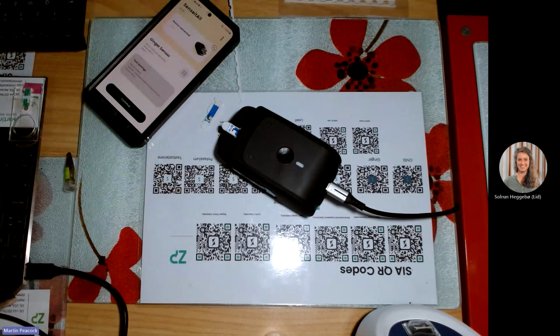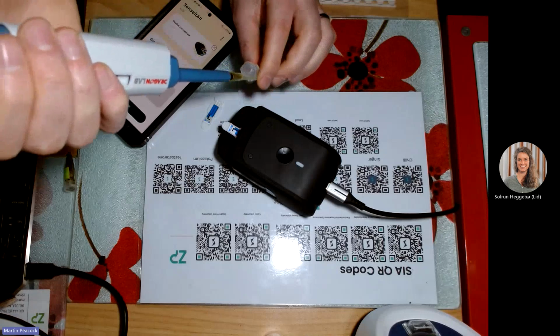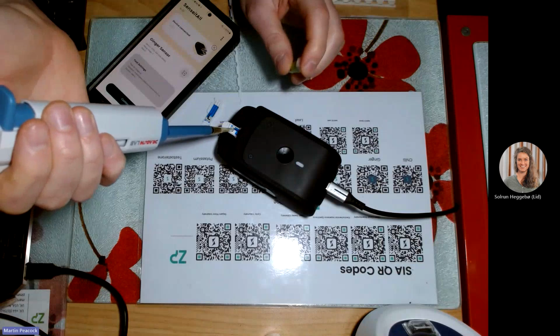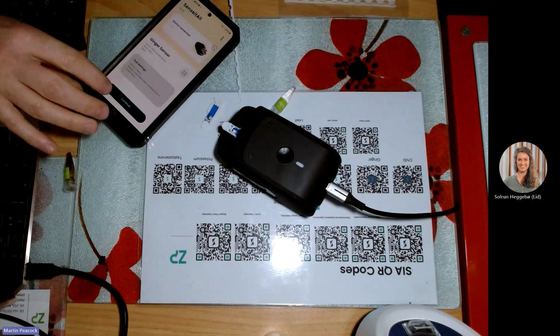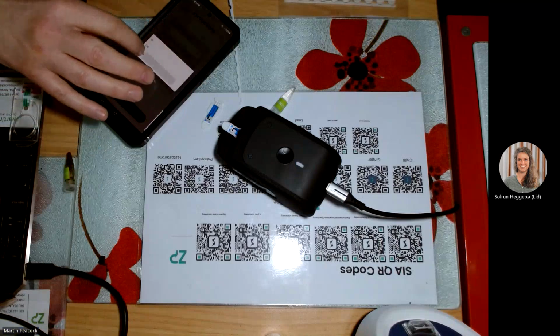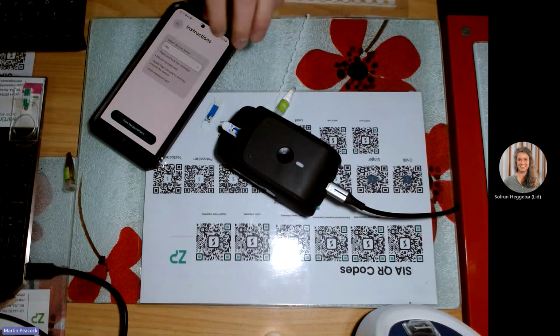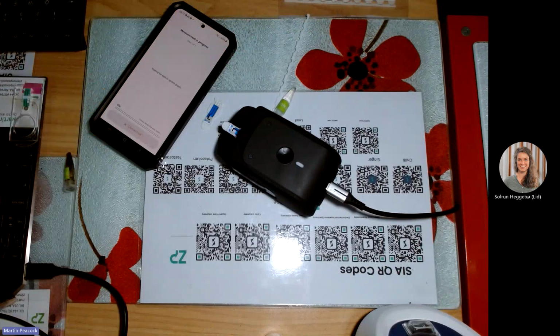What I'll now do is take that 50 microliters that I mentioned. I will pipette this up and put it on the sensor. It's gone onto the sensor. I'm just thinking aloud to myself, so you can probably hear my thinking. I'm just telling it how diluted I made that sample. I actually diluted it 1,000 times. I'm just going to hit start.